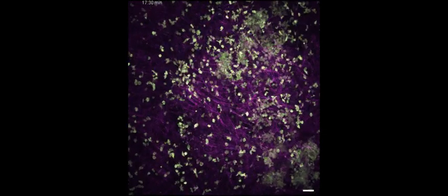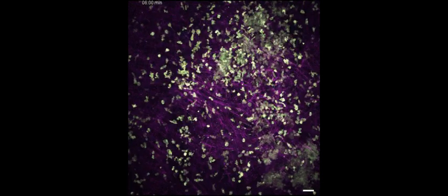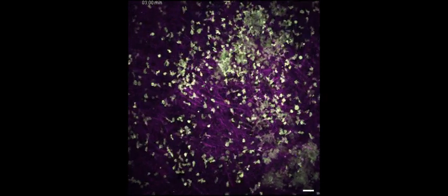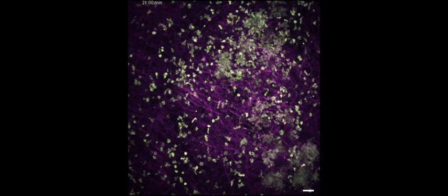After four to six days, you see cell clusters appearing where cells are immobile. The cells that are not in these clusters are very mobile.